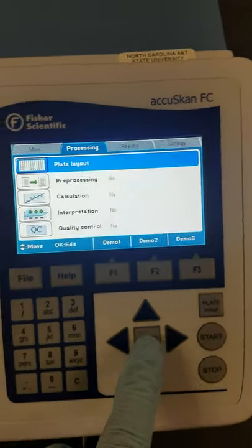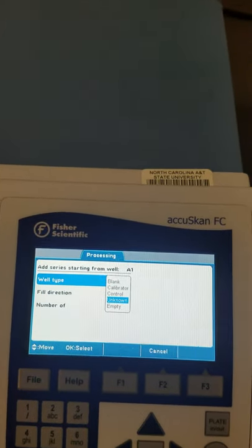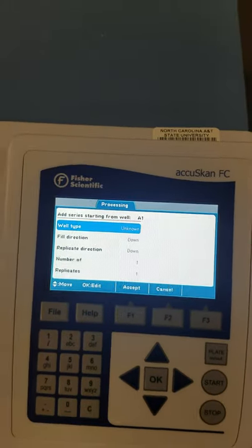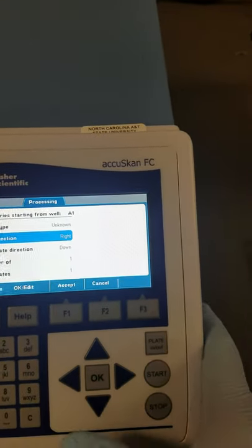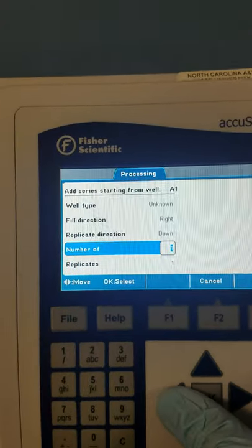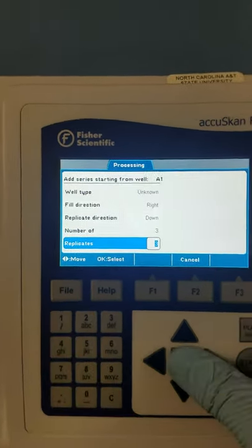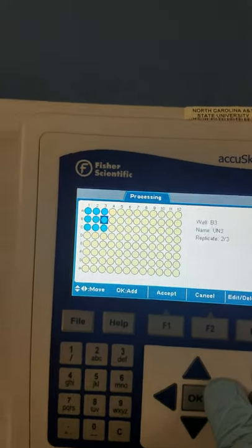Now the good stuff — we go to plate layout, and we want to set up our plate here exactly like we have it. It only has one type of variable, as far as I can tell. For now, we're just going to click on Unknown, and we want to have a fill direction to the right. We have three different types of samples, and we want three replicates going down of each one — so we want three for each one. You can also type in the numbers over here. Once you click Accept, you will see that you have your wells shown in blue.